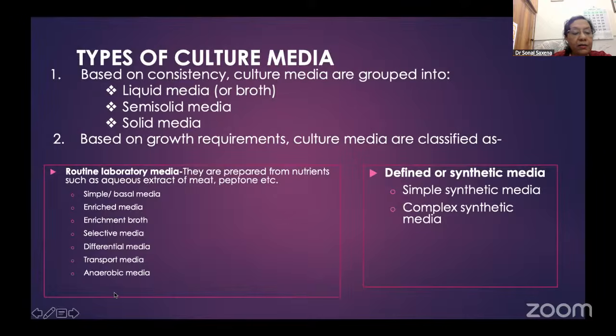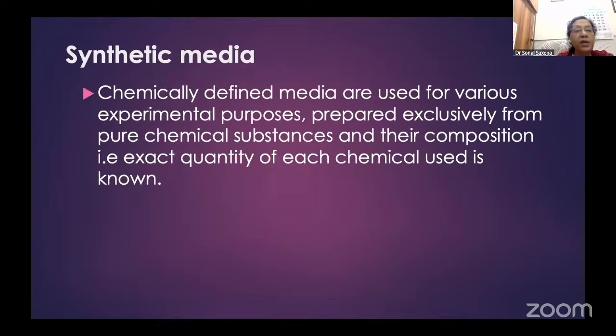And then selective media, which has got an agent which is going to inhibit the commensals. For example, in Thayer-Martin medium, there is something added to it. In SDA, which is a selective media for fungi, there are antibiotics added to inhibit bacteria. Differential is where you can differentiate, whether it is a pink colony or non-pink colony. Transport is, of course, for transport, and anaerobic is, of course, for anaerobic organisms.